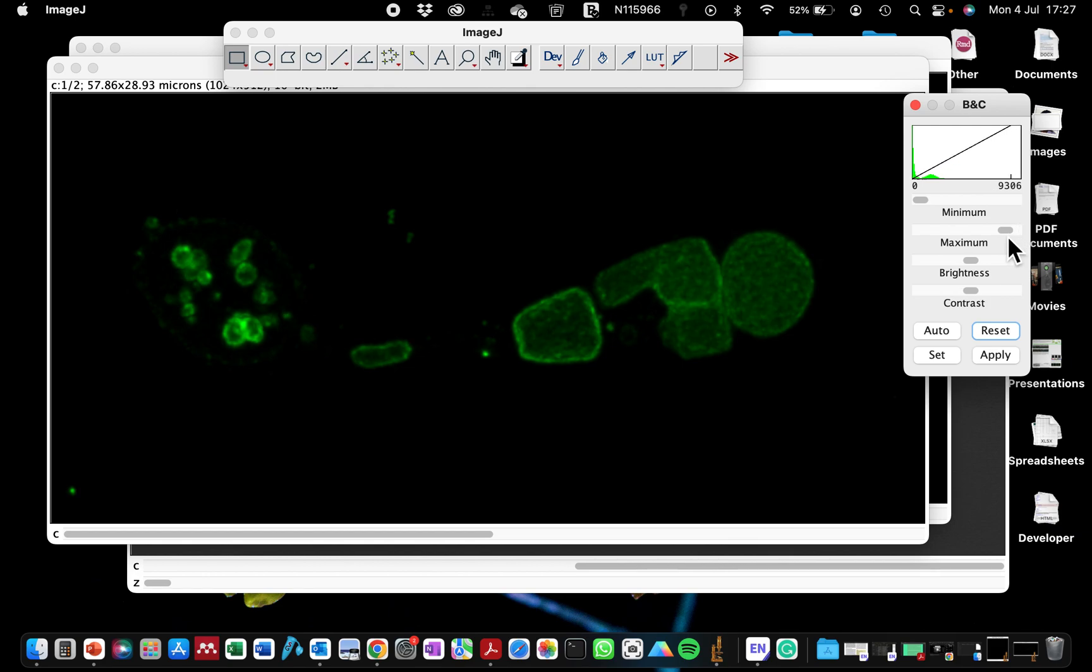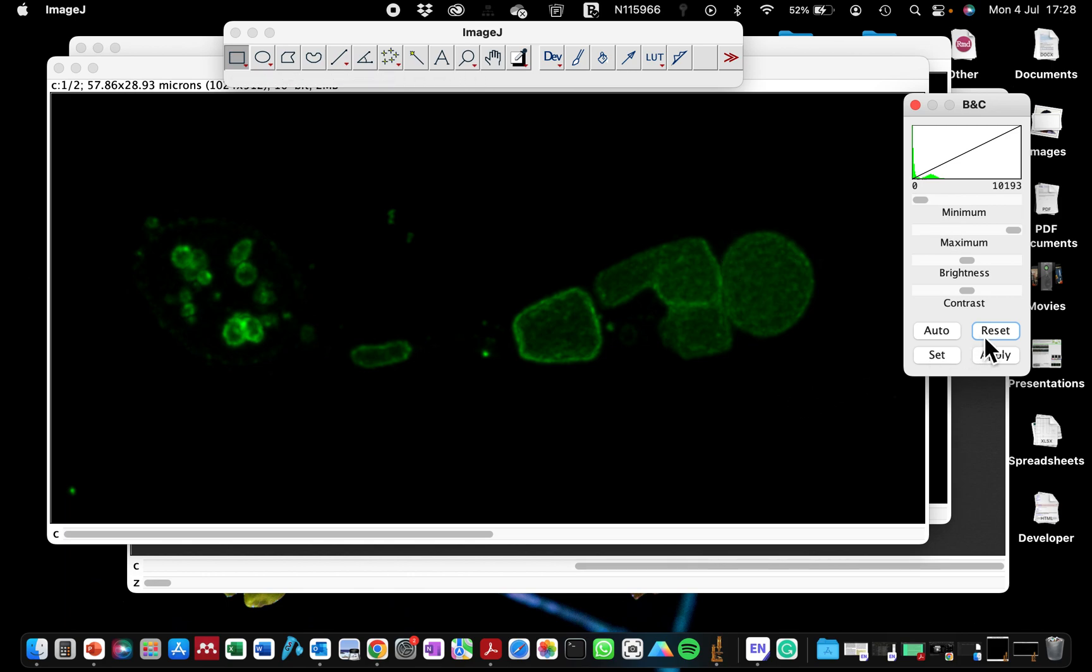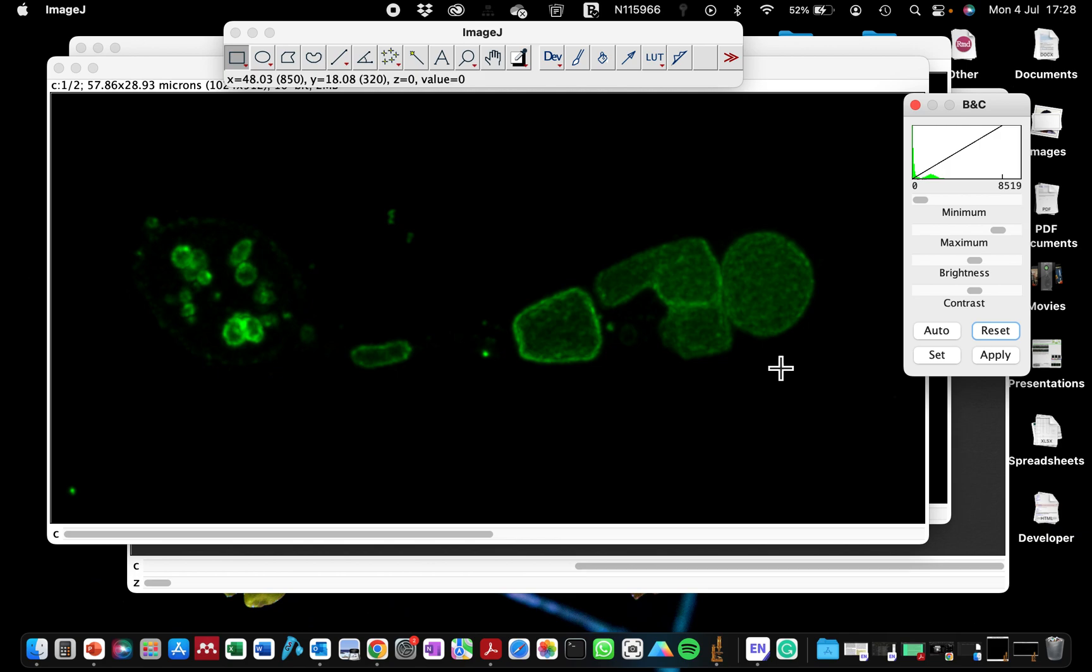So if I was to do this on my own, I could just decide that, okay, after reset it was 10,000. So it means all the images I'm going to be working with, I first click on the reset and then just drag this a bit. So if I'm using 8519, I'm going to be applying that to all other images that I have open.